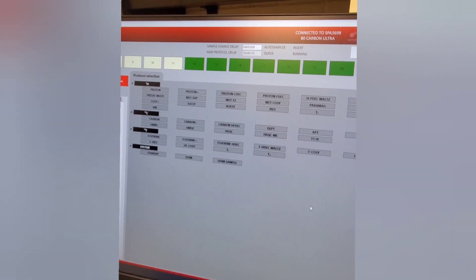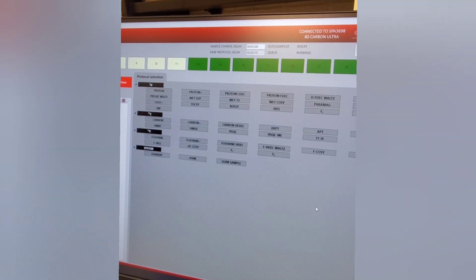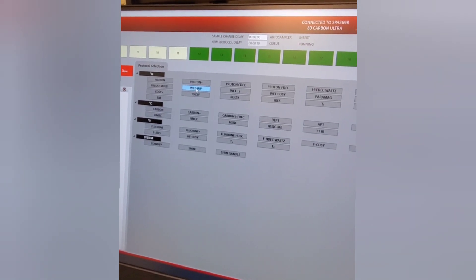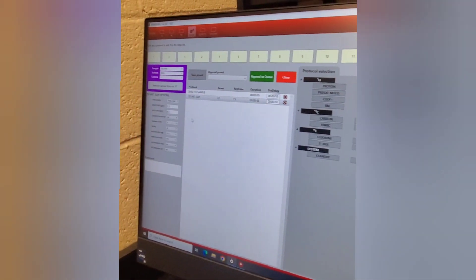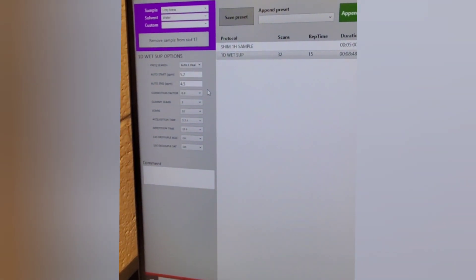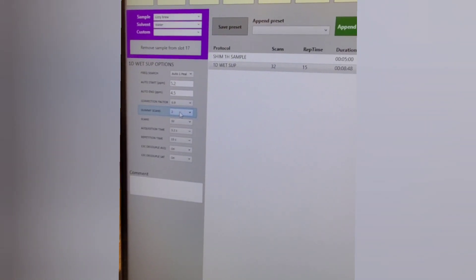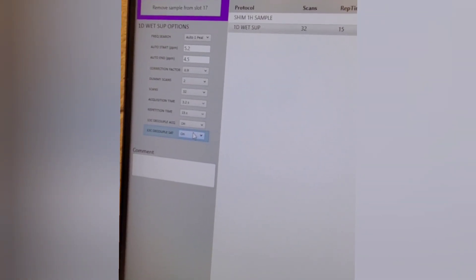The next thing we want to do is set up the instrument to acquire the actual spectrum. We want to use water suppression — specifically WET suppression — to suppress the water peak so we can see the other peaks. Hit the WET suppression button. Make sure the correction factor is 0.9, which works best for kombucha samples. We'll stick with two dummy scans and 32 scans of our sample. Also make sure that carbon-13 decoupling is on for both settings.